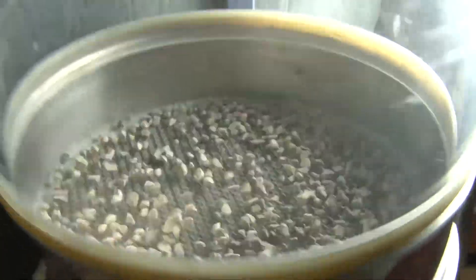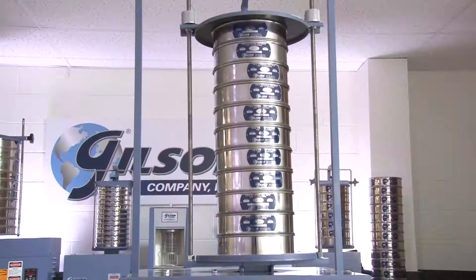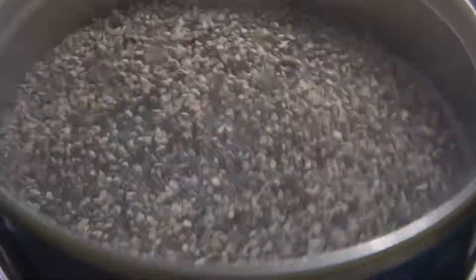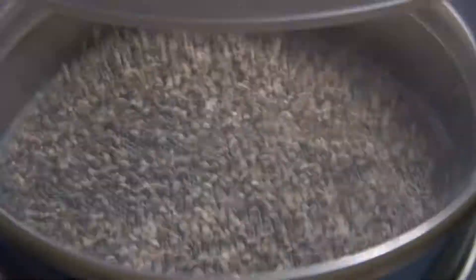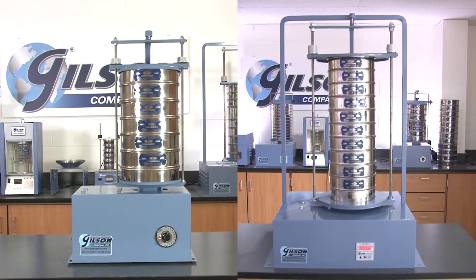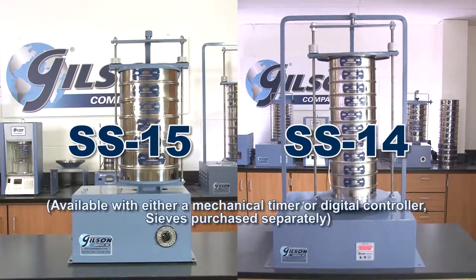Orbital sieve shakers mimic the motion of hand sieving and are an affordable choice for sieving free-flowing materials. Particles are rolled around the mesh surface until they fall through an opening. And Gilson's dependable SS15 and SS14 orbital sieve shakers are designed for maximum versatility.